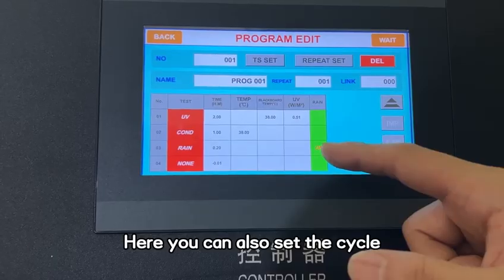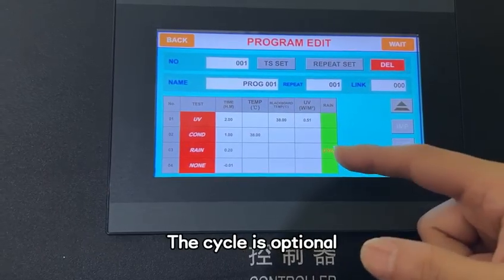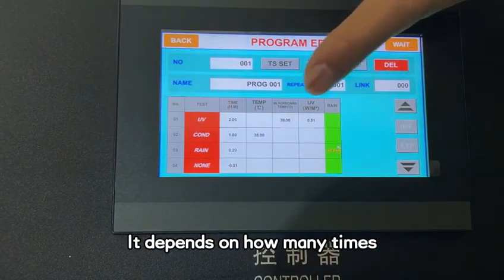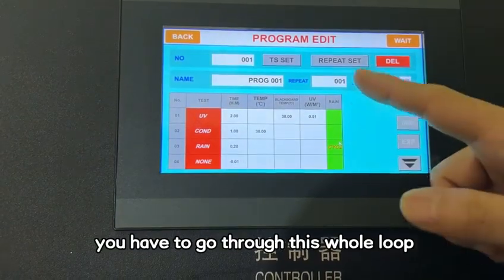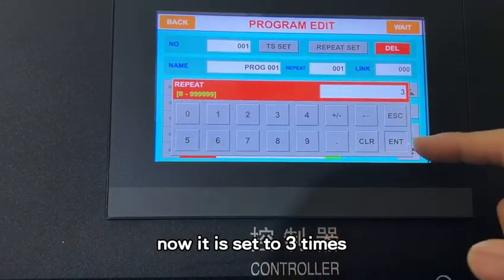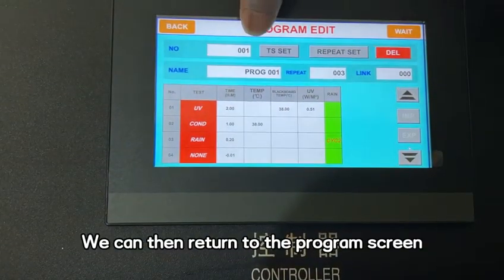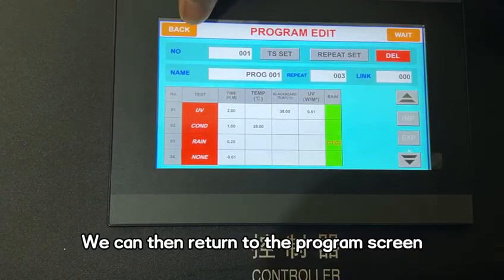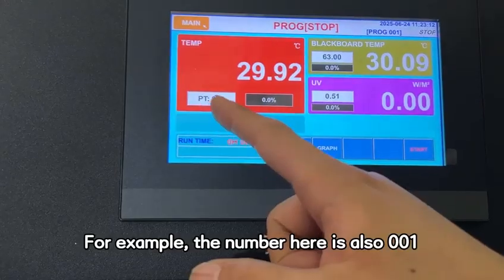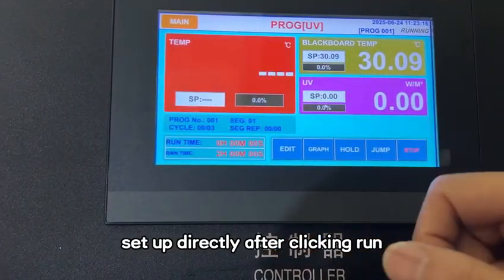Here you can also set the cycle, but you need to go to another place to set it up. The cycle is optional. After setting these up, it depends on how many times you want to go through this whole loop. Currently this loop is 1 time. Now it is set to 3 times. After setting it up, we can then return to the program screen. The number here is 001. For example, the number here is also 001. Set up directly after clicking run.